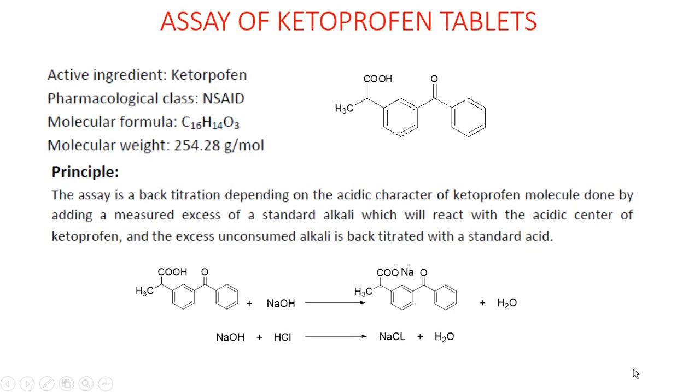Assay of ketoprofen tablets. Ketoprofen is a non-steroidal anti-inflammatory drug with a molecular formula C16H14O3 and molecular weight 254.28 gram per mole.